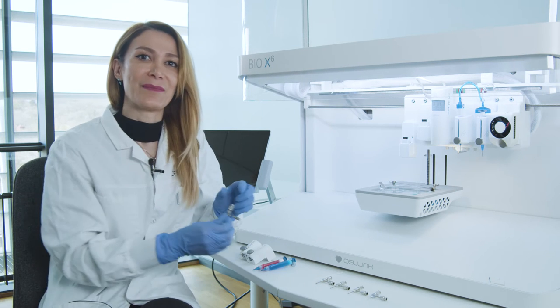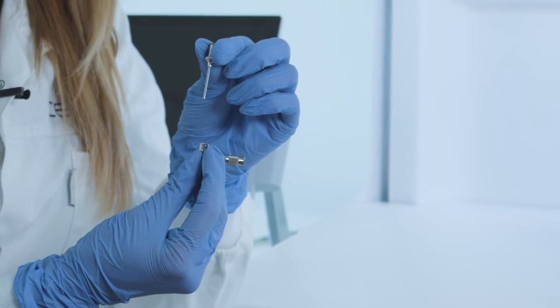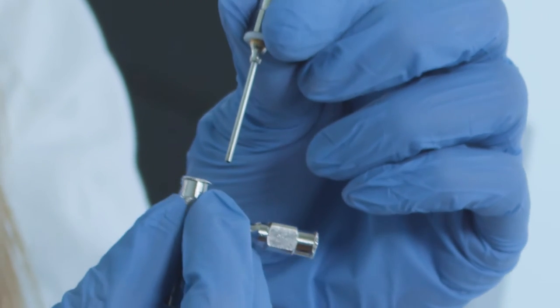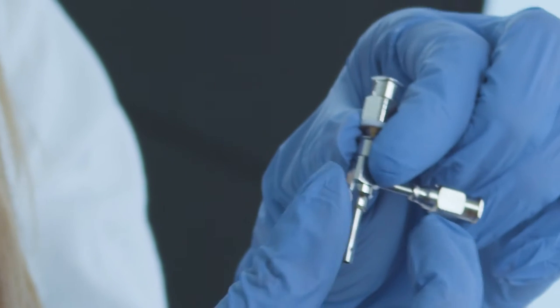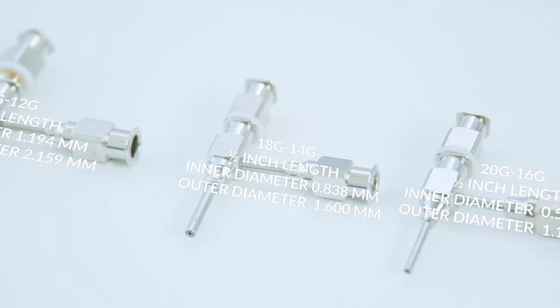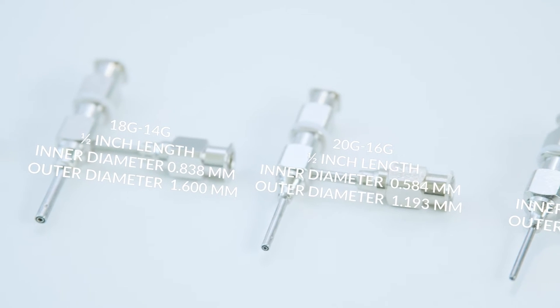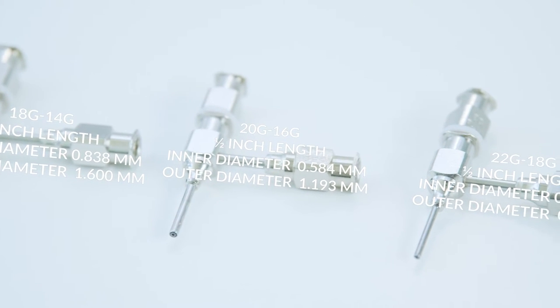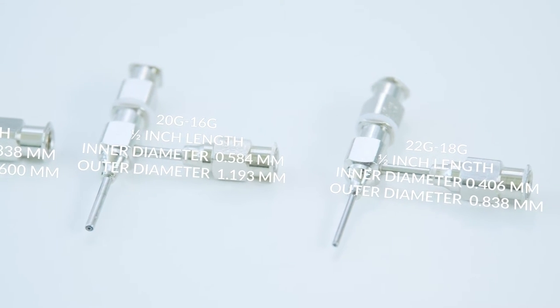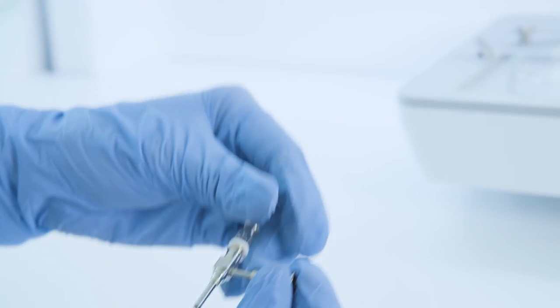It includes a nozzle specific for the inner layer, which is located inside the other nozzle designed for the outer layer, and the gauge size for each is written on the nozzle. If you are working with cells, it is recommended to use nozzles with shorter lengths — half inch — to provide less pressure on the cells.